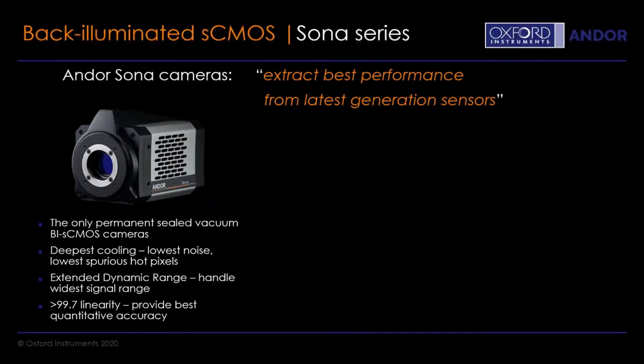And since many studies, like the one that's been shown, show that quantitative accuracy is one of the fundamentals of any imaging camera whenever we're trying to analyze that data. So beyond just the simple taking of the images, as we can see, it's very important to have a quantitative camera, and that has been one of the aims in these cameras as well, to make them as accurate as possible.